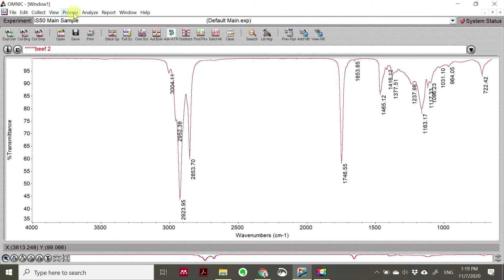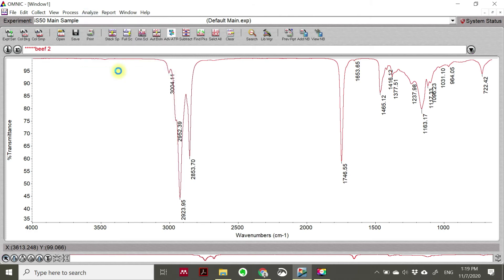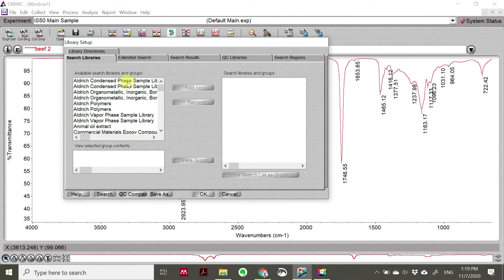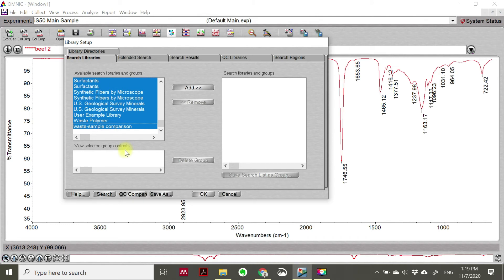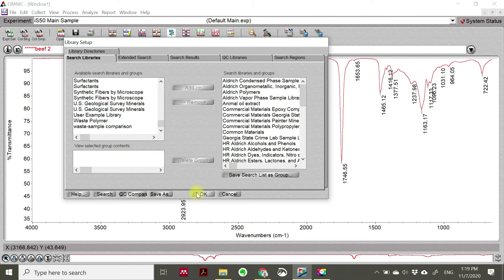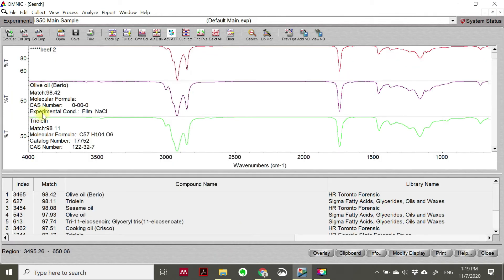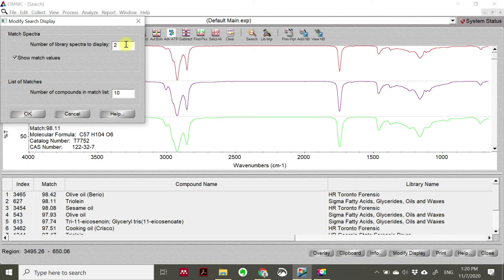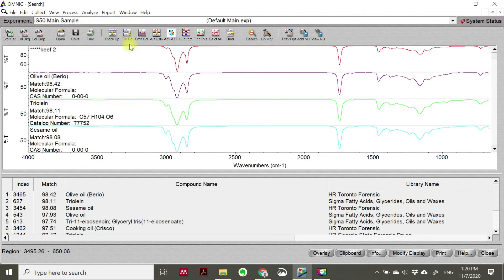But now we also have software equipped with a library, so we can identify using the library. Just click 'Analyze' and then click 'Library Setup' first. When you have library setup, you will see there are viable search libraries equipped in this FTIR software. Just highlight each of these libraries, click 'Search'. I want to modify the display - number of library spectra to display, maybe three.